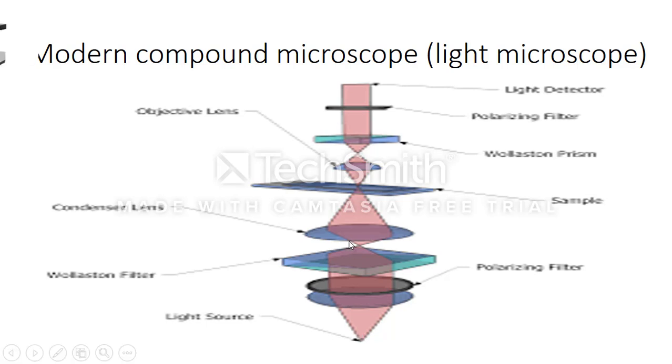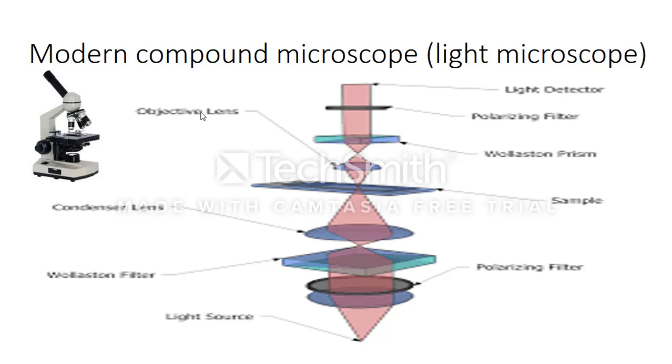So this is simply the rotating things here. You can adjust which one you want up here, and a higher value for this will allow resolution to be lower, which is better.